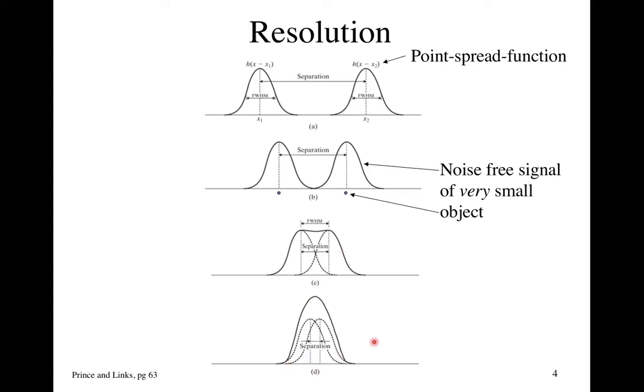Interestingly, in super resolution microscopy, if you have an object here and an object here, or even here and here, and they're fluorescing, but they're fluorescing at such a low rate that you can detect the photons from this as basically a separate event from the photons from this, you can, by doing a temporal analysis of your signal, detect where the mean value of this fluorescing object is, even though it's a spread out value like this.